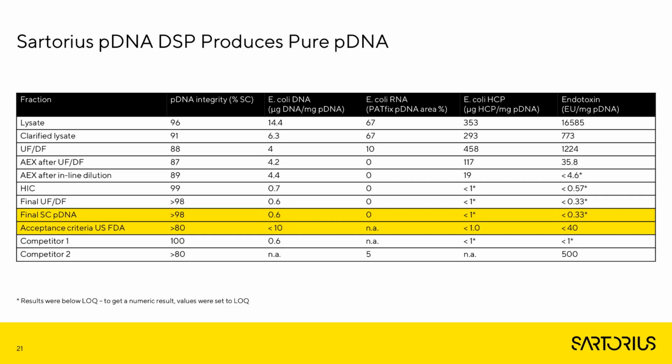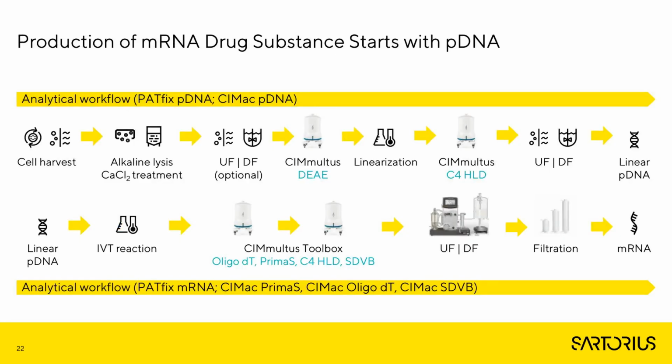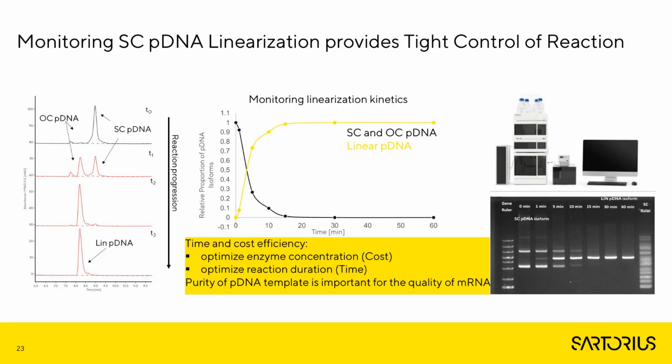And so this is what we take into the mRNA flow. So we have traveled a long way through this process chart already. We made our supercoiled DNA. Before we can start to produce mRNA, we just have to linearize it, linearize a supercoil. We use a restriction enzyme, depending on the construct, BspQI, NdeI, whatever your construct is compatible with.